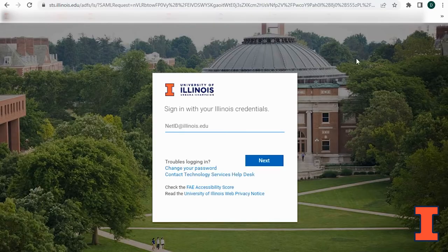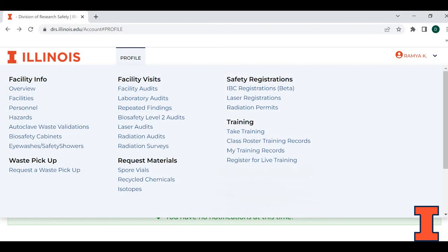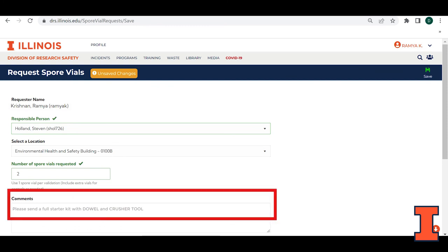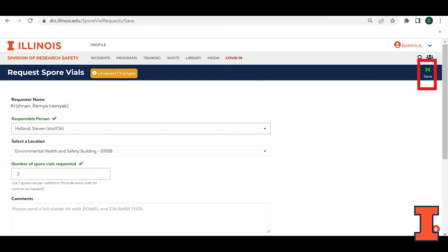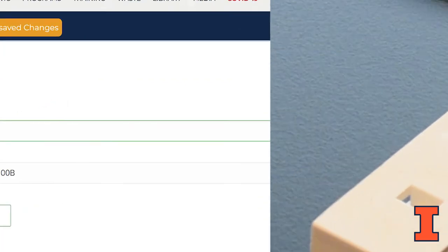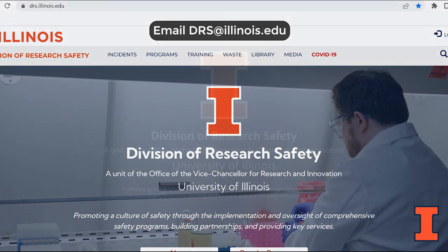Log into your profile using your email address and password. Located under profile, select request materials, then select spore vials. Fill in the details including the responsible person or PI, location where you would like the vials delivered, and the number of vials needed. When performing an autoclave validation for the first time, or if you do not have a crusher tool and dowel, use the comment box to request them. Hit the save button to finalize your request. Save the obtained crusher tool and dowel for future validations. For any questions, please reach out to us at drs@illinois.edu.